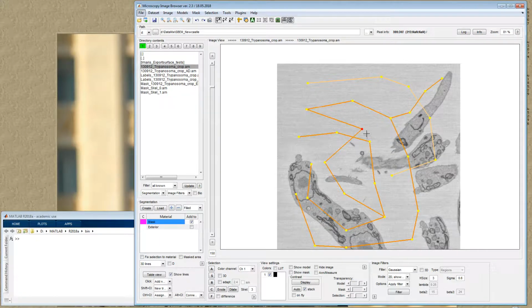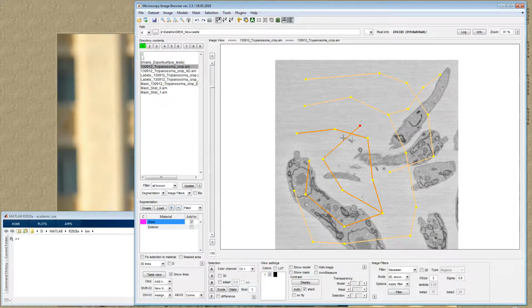When I do this, I can see that I made a new segment, and this segment connected this node of this tree to another tree, and these two trees are now fused together and shown in the same kind of darker color. By the way, all these colors can also be changed to whatever you like. You can change the colors for all the nodes, active nodes, and all the segments.